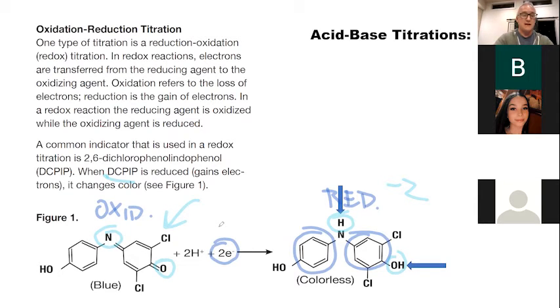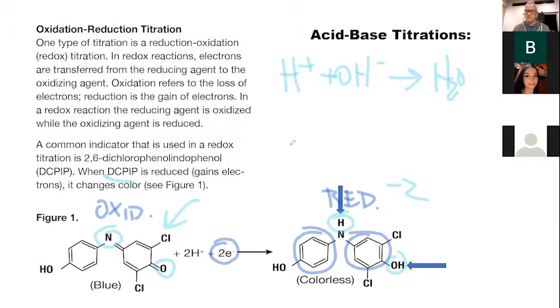Now I'm going to compare that to an acid-base titration. Now with an acid-base titration, we have H plus and OH minus, and they come together and form water. That is the classic neutralization reaction. So I have a question for you guys. Is this a redox reaction?